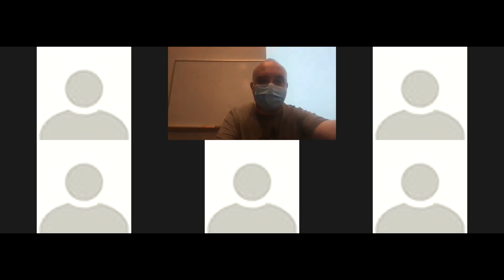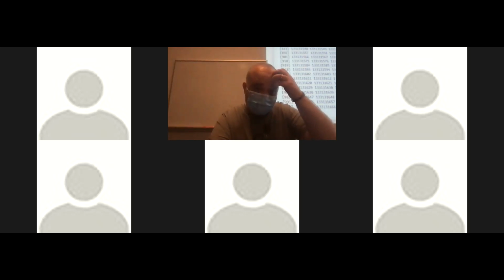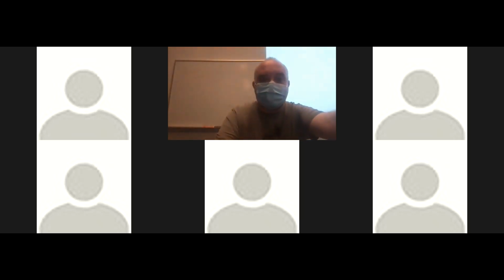Once I have this sequence, let's just have a look what that actually looks like. It should just be a string of numbers. Okay. I'm then going to use that to index my RLE list, my RLE object.